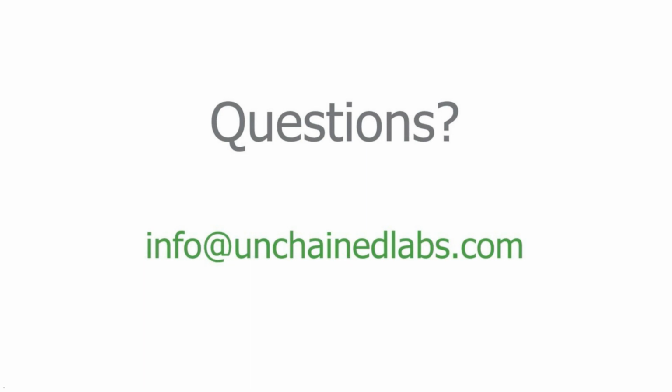Great, thank you. This next question asks, how would testing thermal stability help me with my process development? Okay, yeah, because I think today we spent a lot of time looking at formulation work and talked a little bit about how this can apply to capsid engineering as well. When you're looking at process development, what's really important here is chromatography steps, where you have different buffers going through your AAV, you're exposed to different pHs and ionic strengths, and even temperatures as well if you're using heated columns.